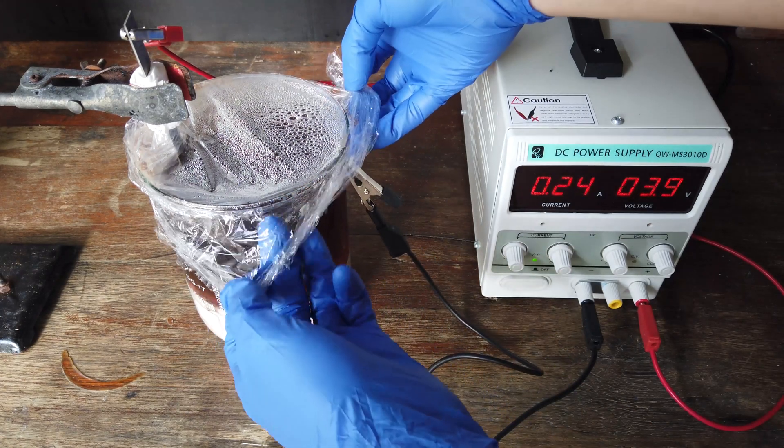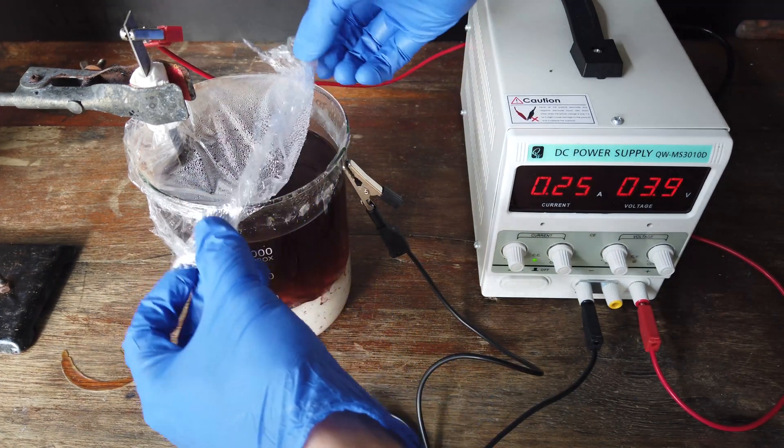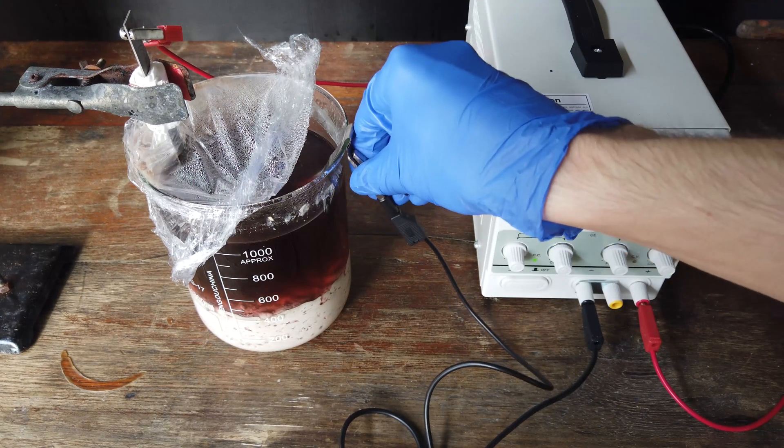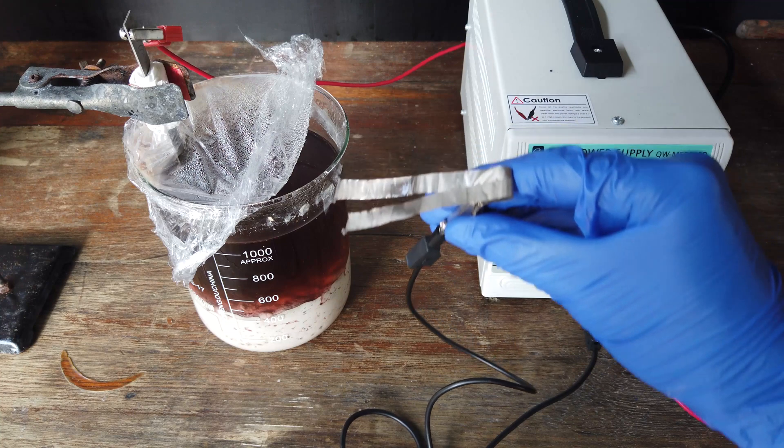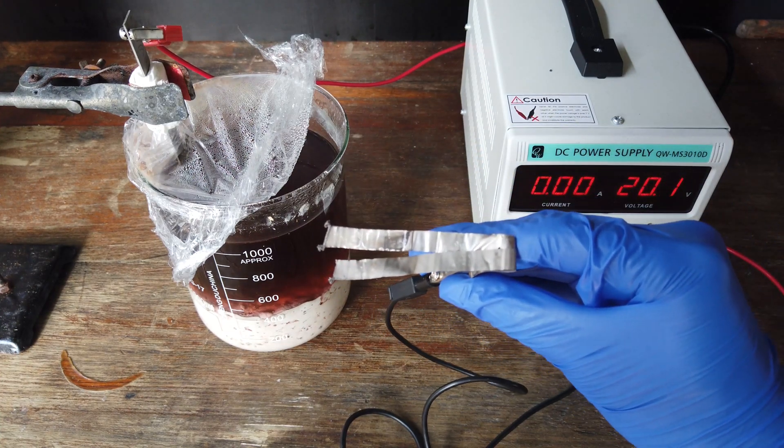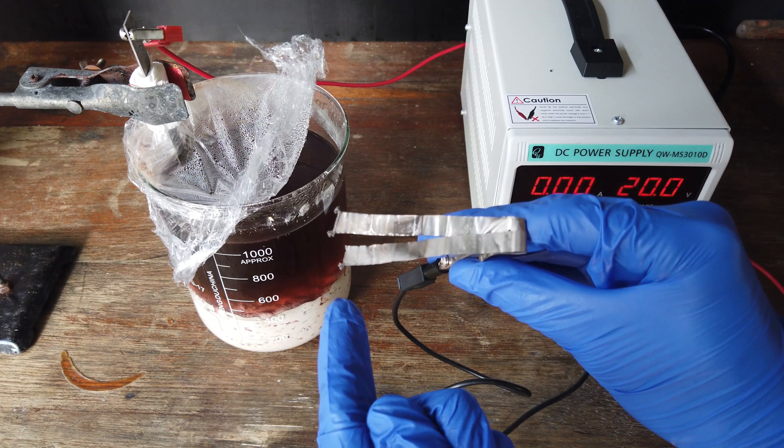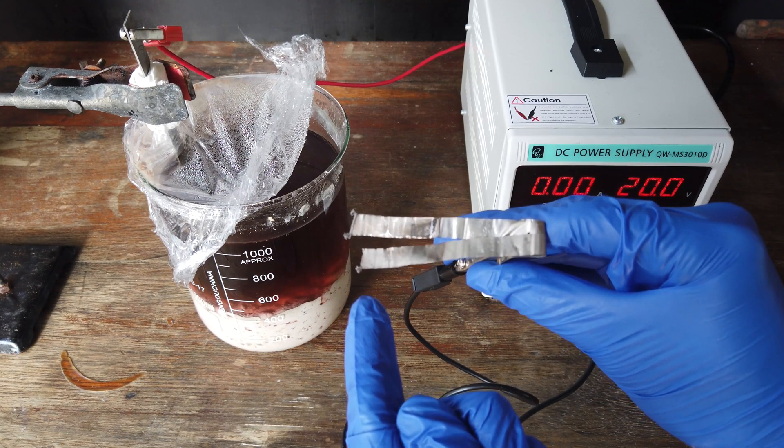Now that the cell's been running for 12 hours or so, let's get a look at the cathode. As you might note, not much has really happened. But we can see the formation of a small amount of metal on the corners of the nickel strips. That's a very promising sign.